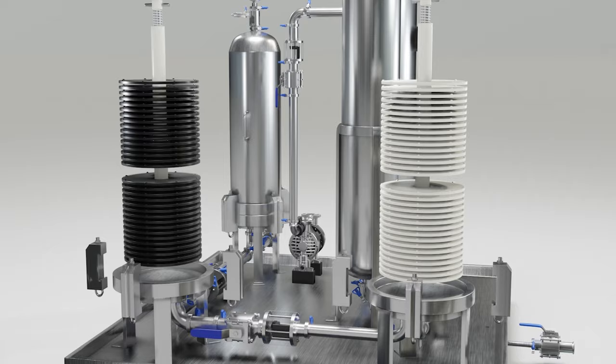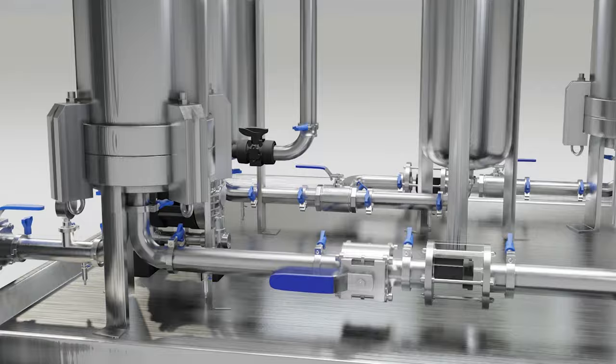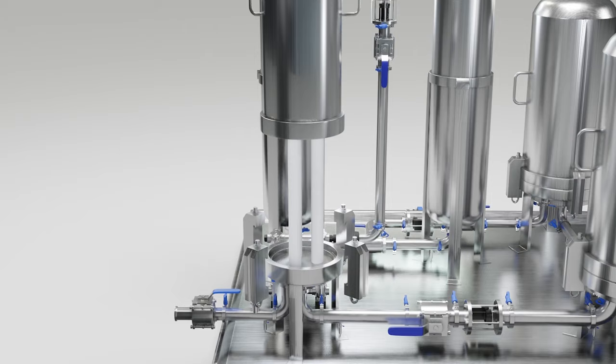Systems are available in 12 and 16-inch versions, up to four modules stacked. The fourth stage in the process is a cartridge filter capable of sterilizing filtration down to 0.2 microns.